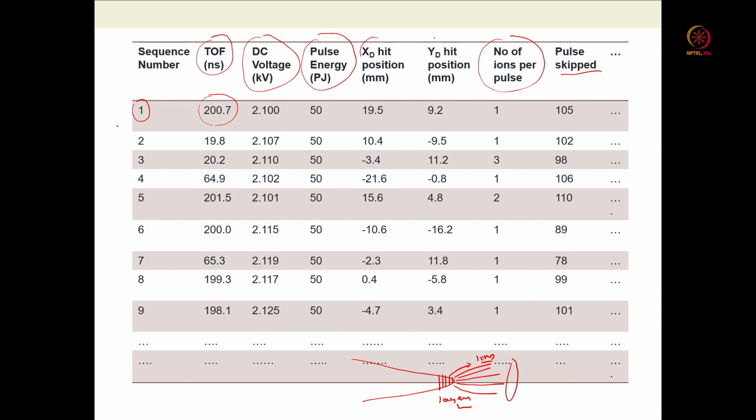So these are the information which we get from a typical atom probe. As it is a layer by layer process, there will be a sequence of layers that get field evaporated, like sequence 1, 2, 3, 4, and depending upon the type of ion, they have a different mass to charge ratio, which is directly related to the time of flight. Some species have a much shorter time of flight, so they are moving much faster, correct? This is related to their mass to charge ratio.